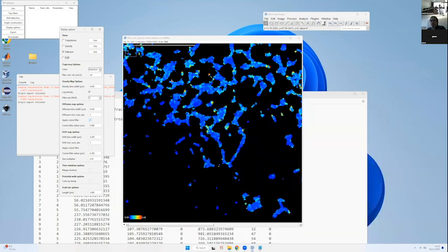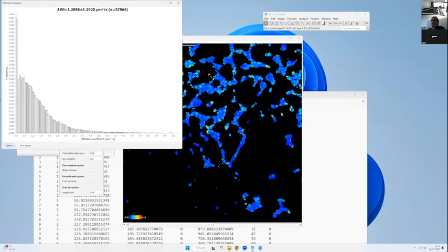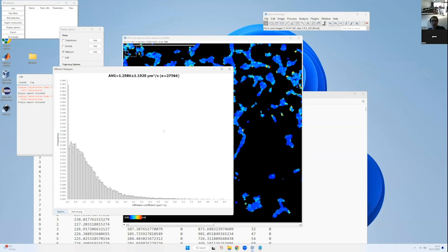One last thing before moving to the drift, maybe. Next to diffusion on top, you have a button called hist, and if you click on it, it will display a histogram of all the values of the bins of your map. For example, what might interest you for a real experiment is to see the average value. Here you see the average value is 1.2 micrometer squared per second. That's, for example, the value you could report as your diffusion coefficient based on this method.